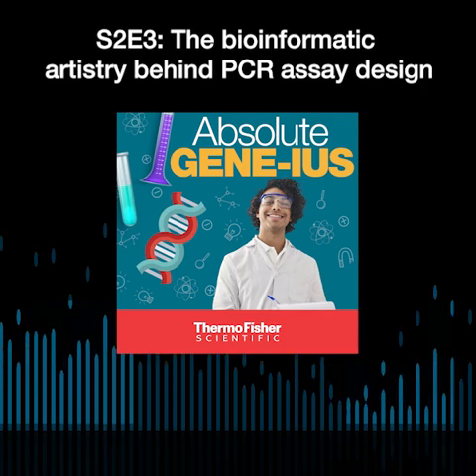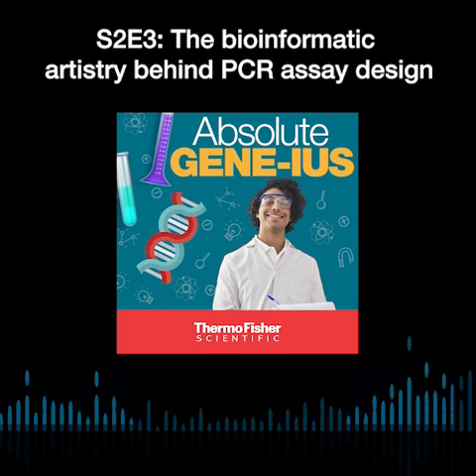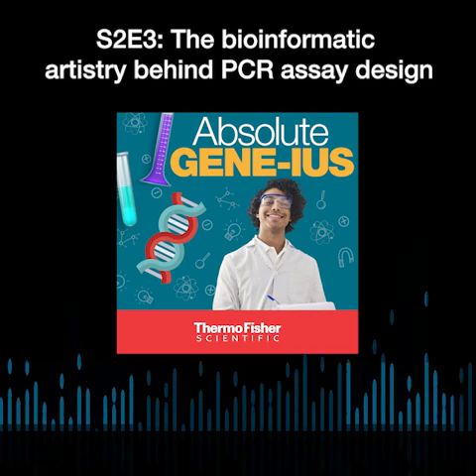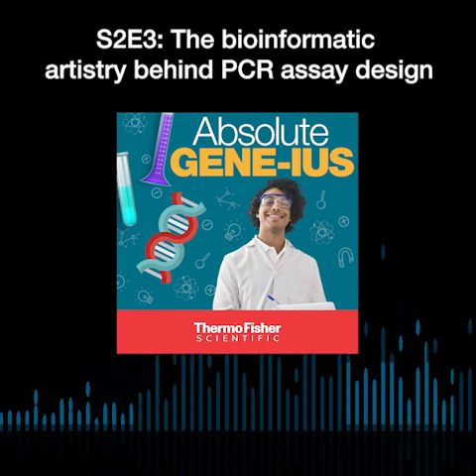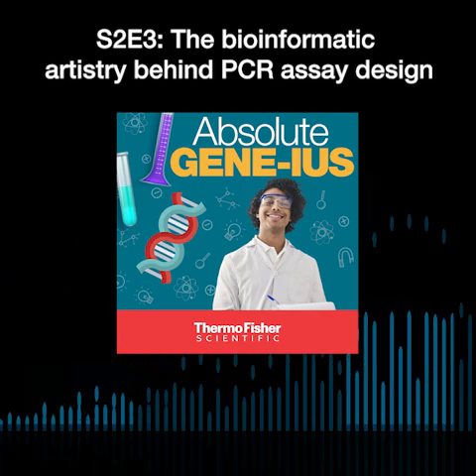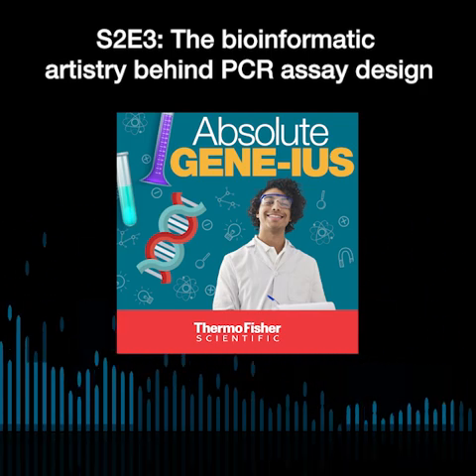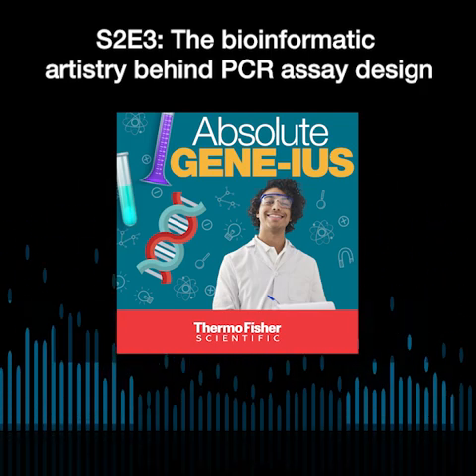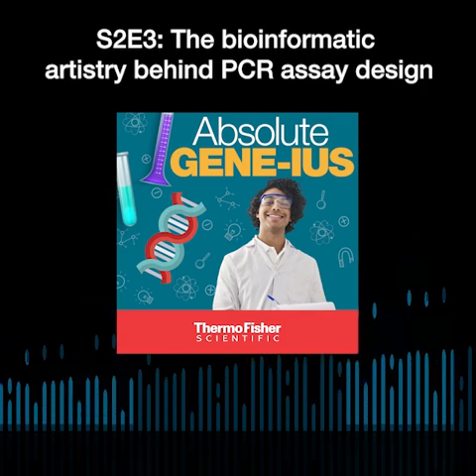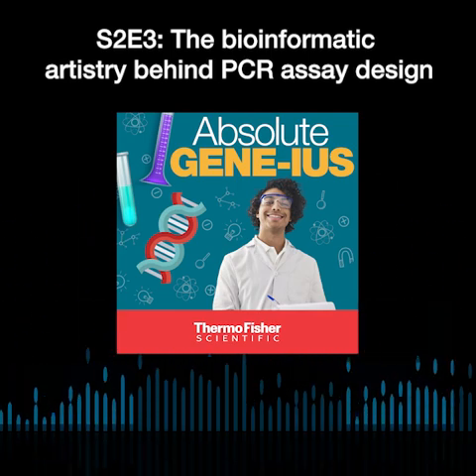target information and genome templates. UCSC we use, or I would encourage people, like an aspiring bioinformatician, to look at it for genome visualization and for looking at whether you have any tandem repeats in the genome, because they have a very nice browser where you can see the other structural variations or other components that are associated with the sequence, and they overlay it very nicely. So UCSC is a good visualization tool, among other things.